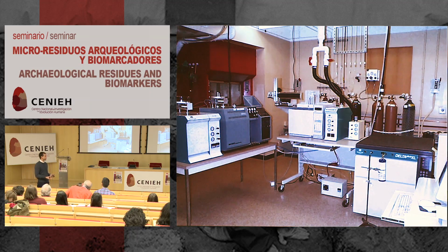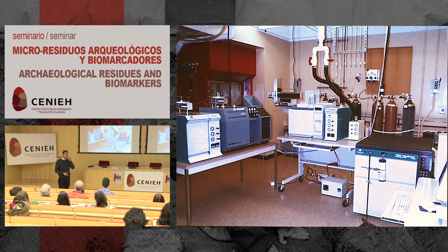You need a proper technician to run the equipment, and it's more than just one contained unit. You have multiple different instruments being used at the same time. And typically, this can cost money if you have to send your samples away to specific places. The cost can add up, especially if you have 30, 40, 50 samples to run.